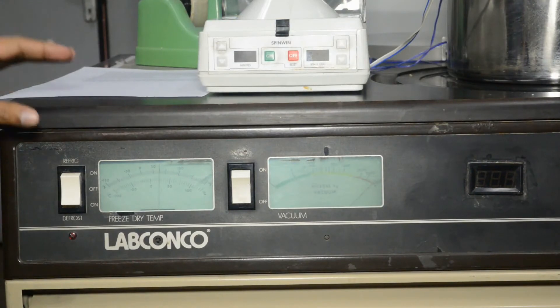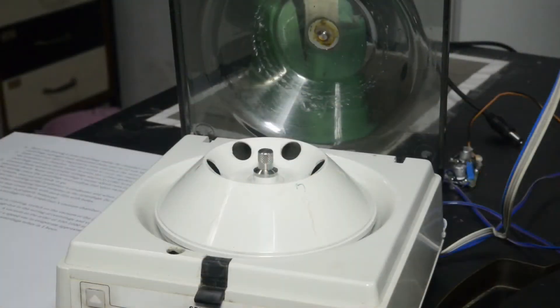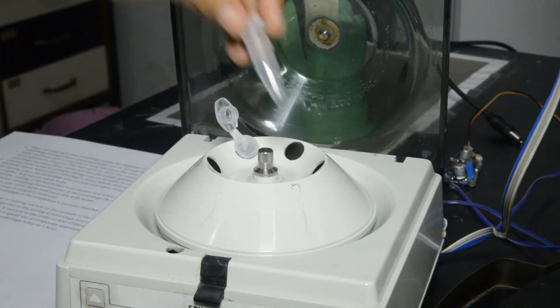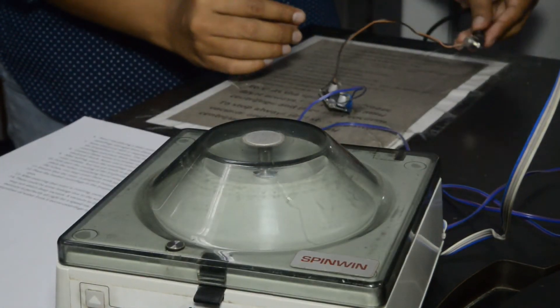First, start the cooling of the lyophilizer's condenser and when it reaches minus 30 degrees Celsius, place the tubes containing liquid samples in the centrifuge. Do not close the lid of the tubes; you may cover them with parafilm with holes. Ensure that the rotor is properly balanced.